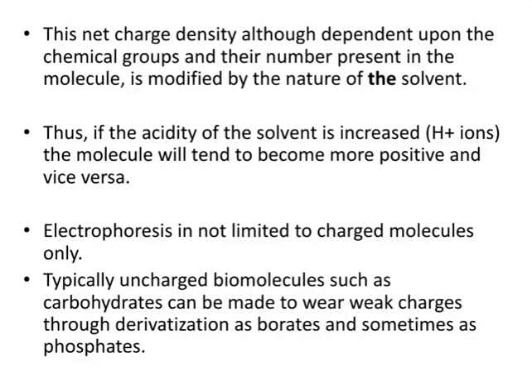Okay, so electrophoresis is not limited to charged molecules only. We have seen that electrophoresis depends on the charged particle, but it is not only limited to charged molecules. Typically, uncharged biomolecules such as carbohydrates can be made to wear weak charges through derivatization as borates and sometimes as phosphates.